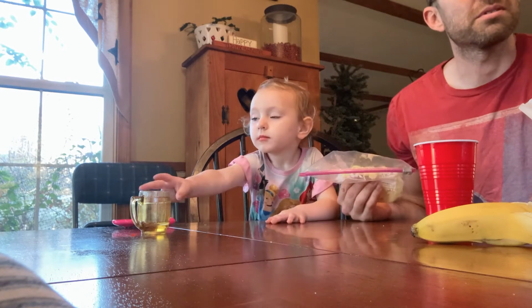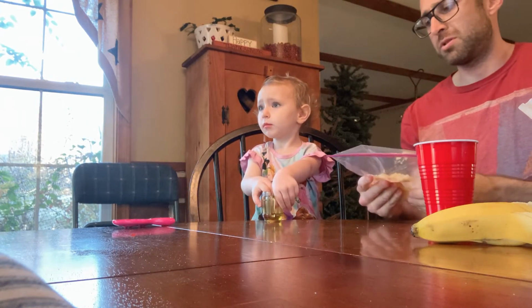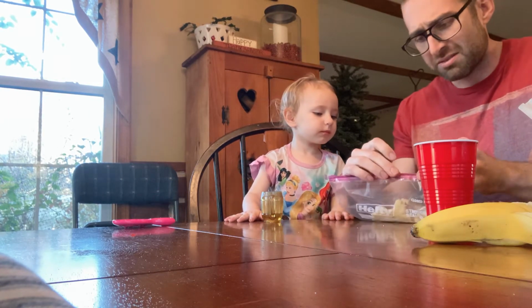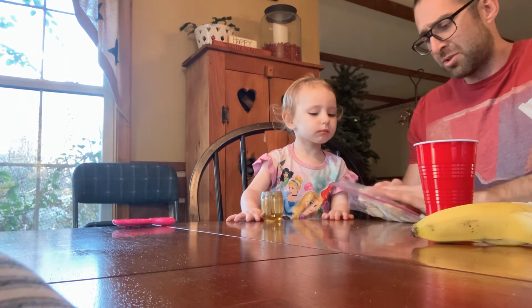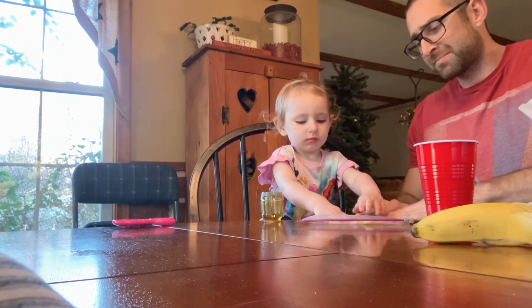Make sure I have the instructions. So you want to mush it until all the lumps are gone, right? See how it's still lumpy? Yeah, it's a little lumpy right now. Part of that is because I got some air in there. Let's get the air out. Oh, yeah. Now we're mushing the lumps. You want to press down? Yeah. Good job.